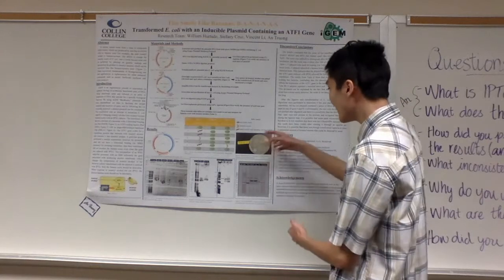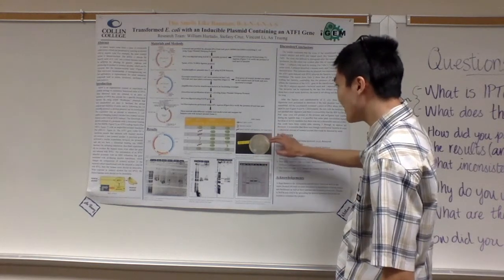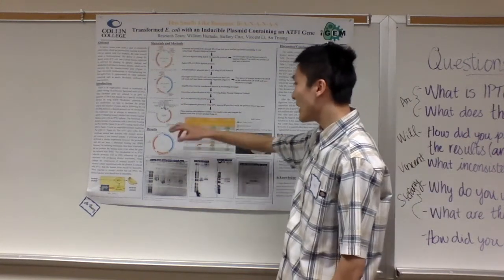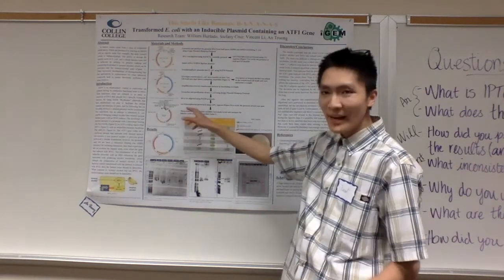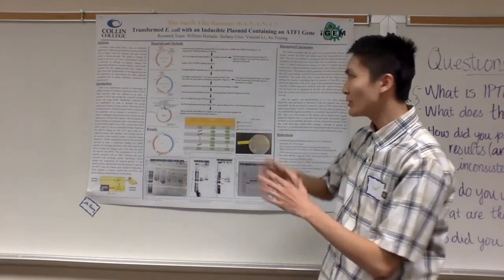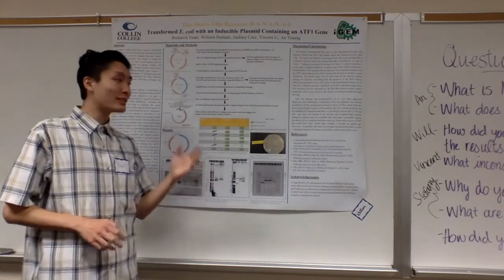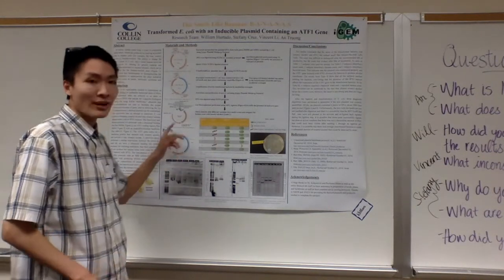And because this bacteria with the plasmid is actually AMP resistant, we could infer or assume that it's somehow taken up a 2,000 base pair ampicillin backbone that somehow religated back together without taking any of the parts. Our results conclude that there are actually some bacteria that have taken up a fully constructed form of our plasmid.